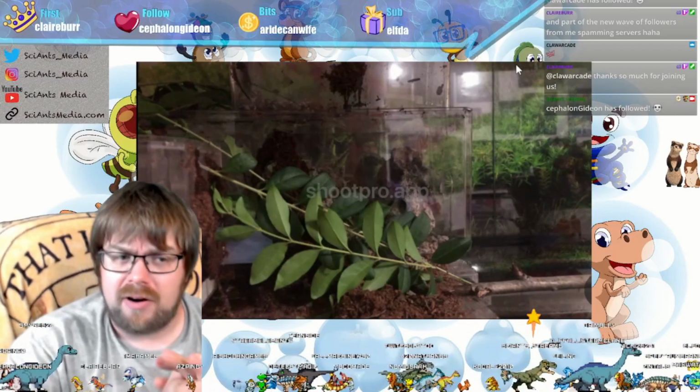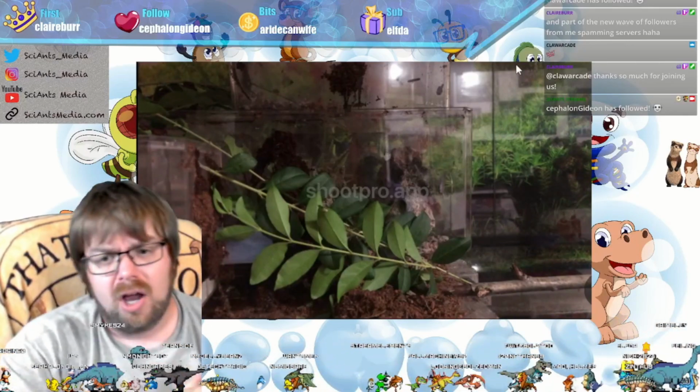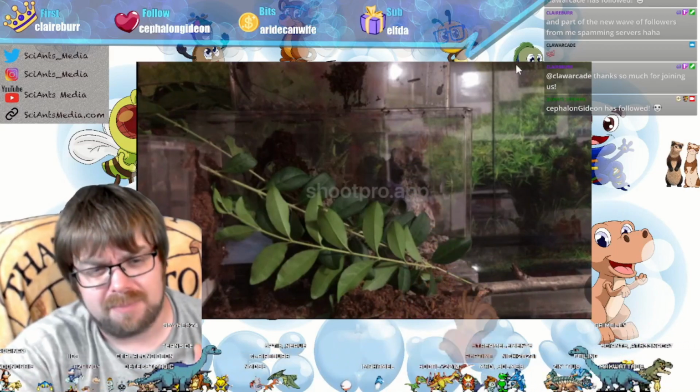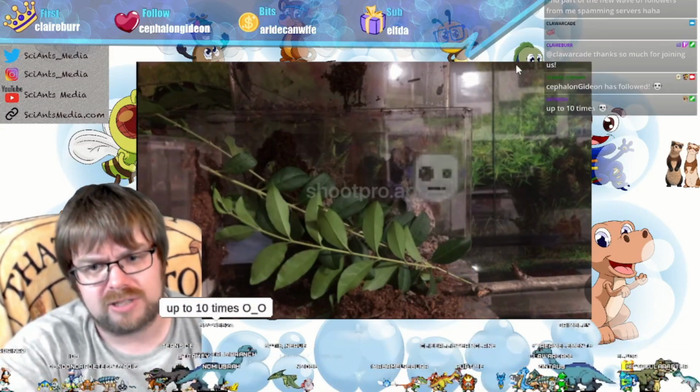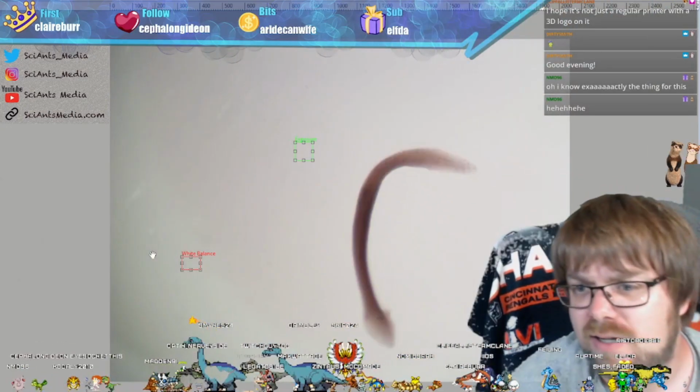So we've gotten a Planarian. We've fed it. It is swimming around doing A-okay. We're going to do the cut today and then watch it over the next couple of days regenerate. In about a week, it'll be fully regenerated, which I think is really, really cool. Let's first find our Jeffrey. I will tell you guys when we do the cut, so no worries. There is Jeffrey.